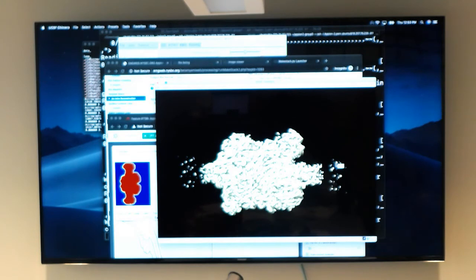defined states. If you have an area with continuous conformation, that's hard, because continuous conformation would be, how many points do you have in a circle? Infinite. So you have an infinite number of conformations, and then you need an infinite amount of data, or you would have to arbitrarily say, okay, I will sacrifice resolution and arbitrarily bin this continuum, and then you would have some more information, but it won't necessarily be high resolution.